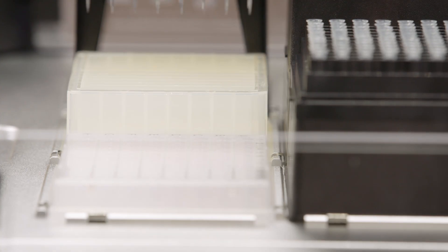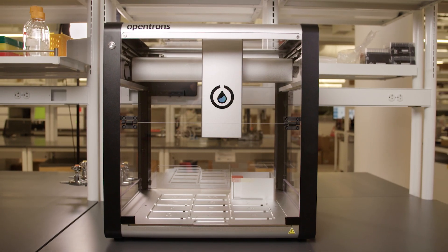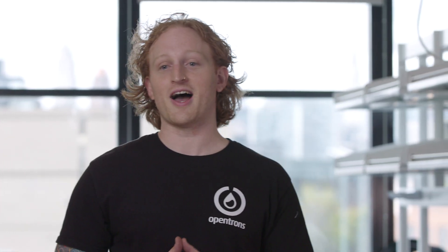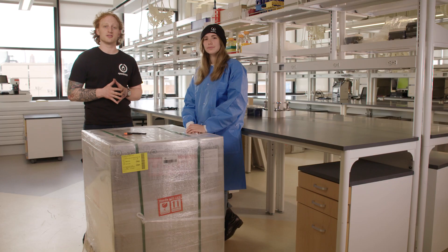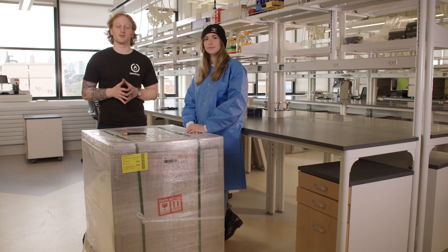and running a protocol on the OT2. For this first video, I'm going to go through how to unbox the OT2. One of the largest value-adds of the OT2 is its ease in setting up, so let's get started.